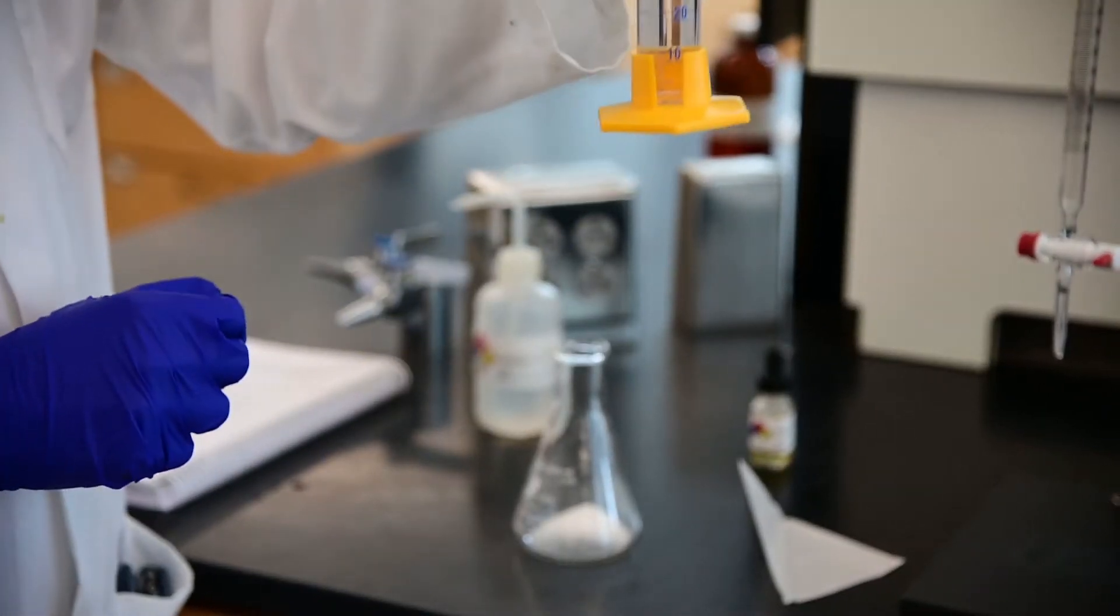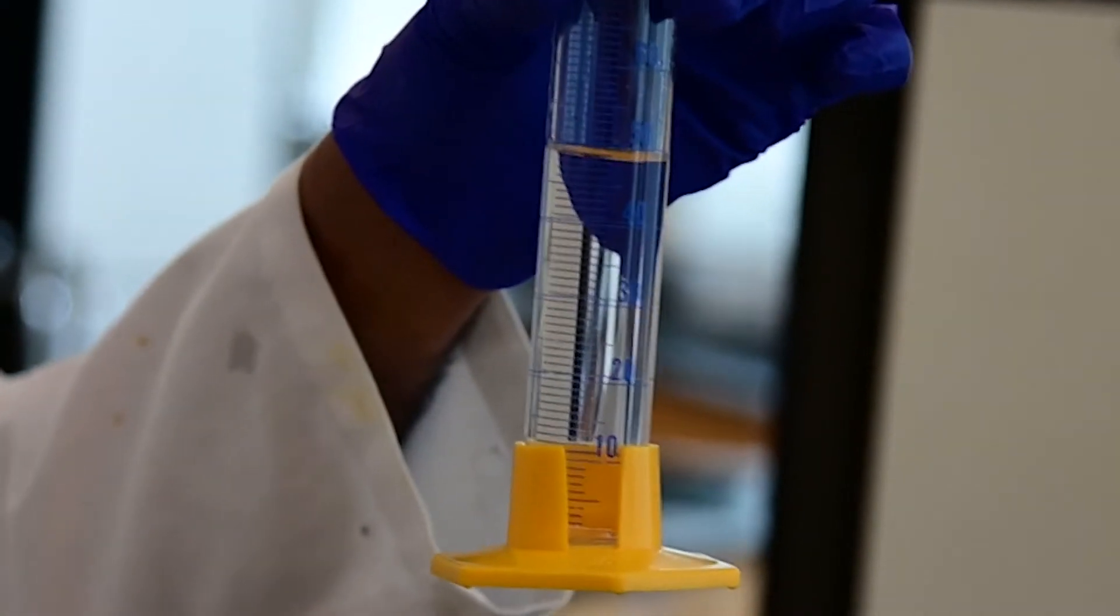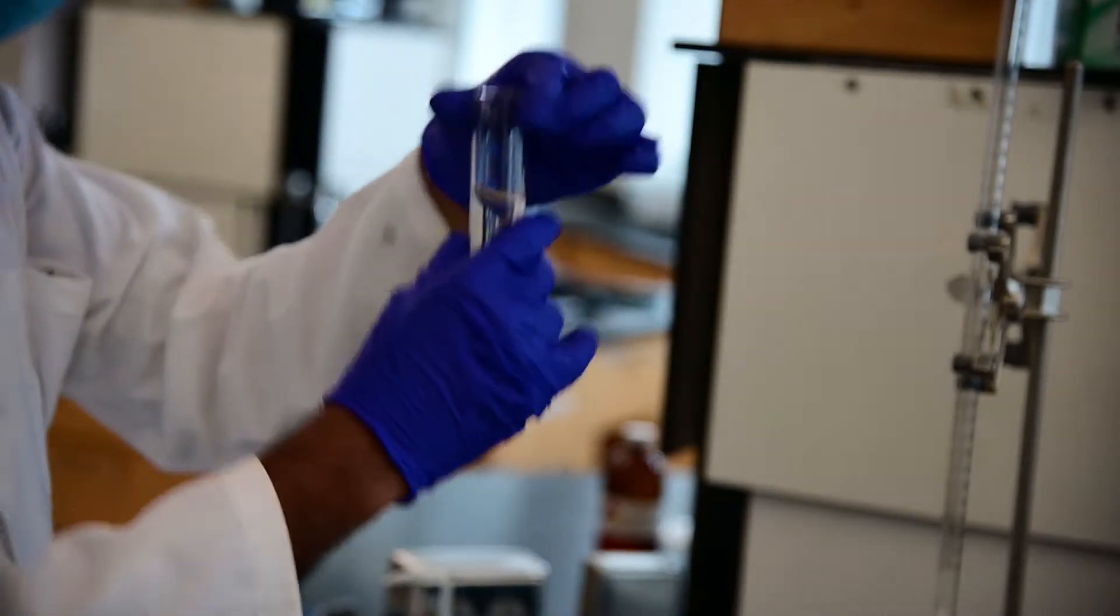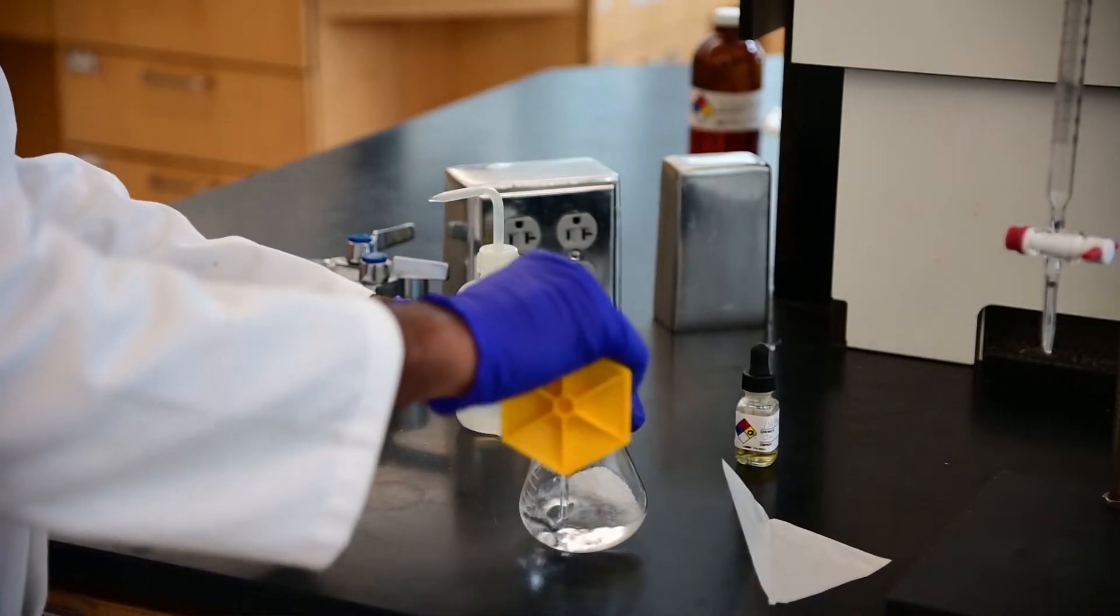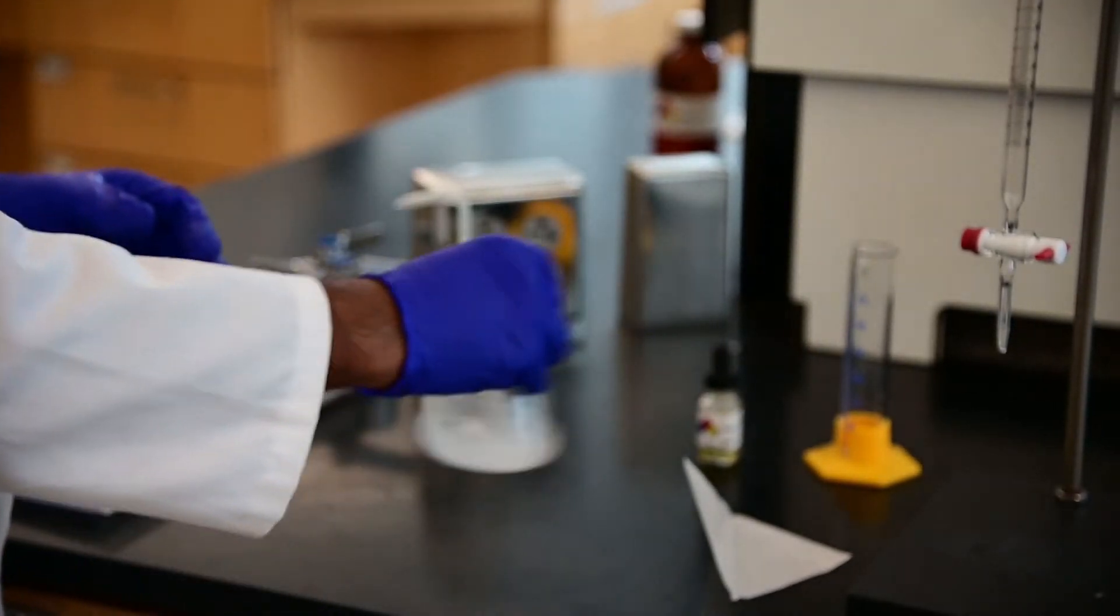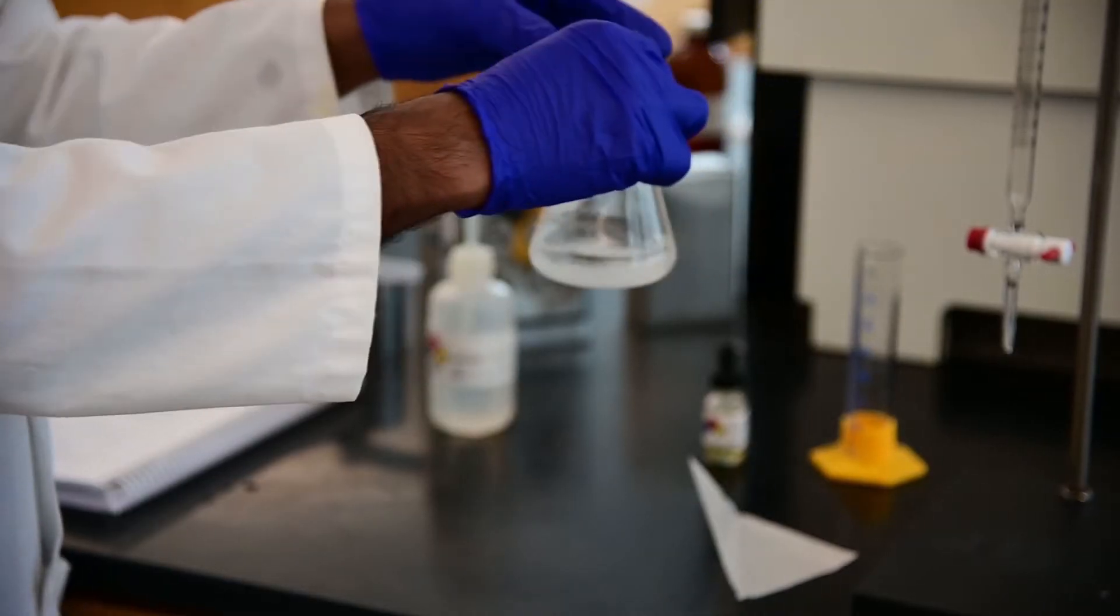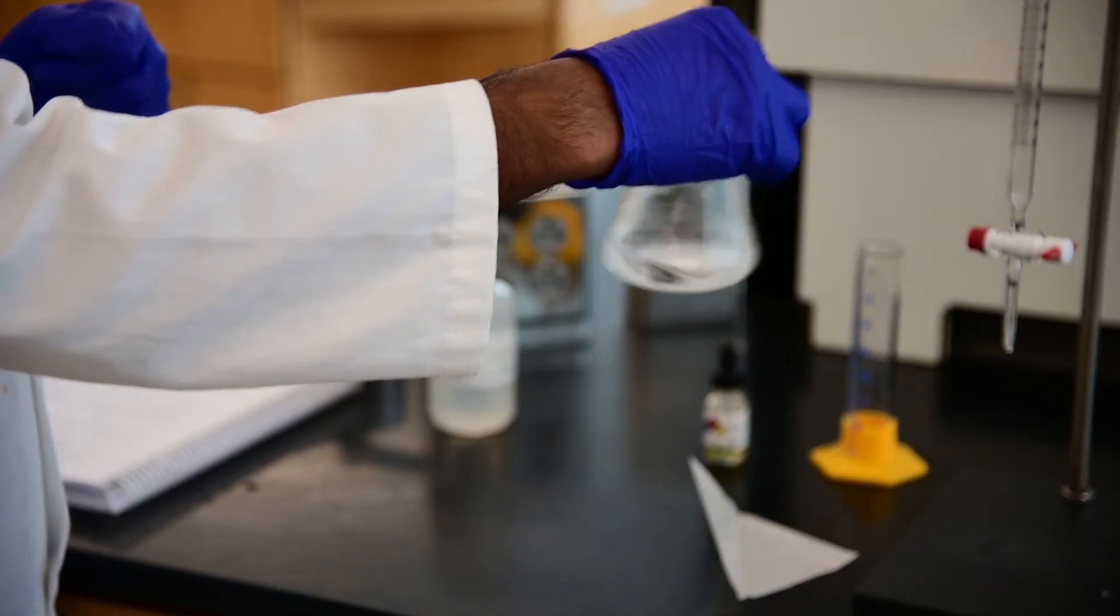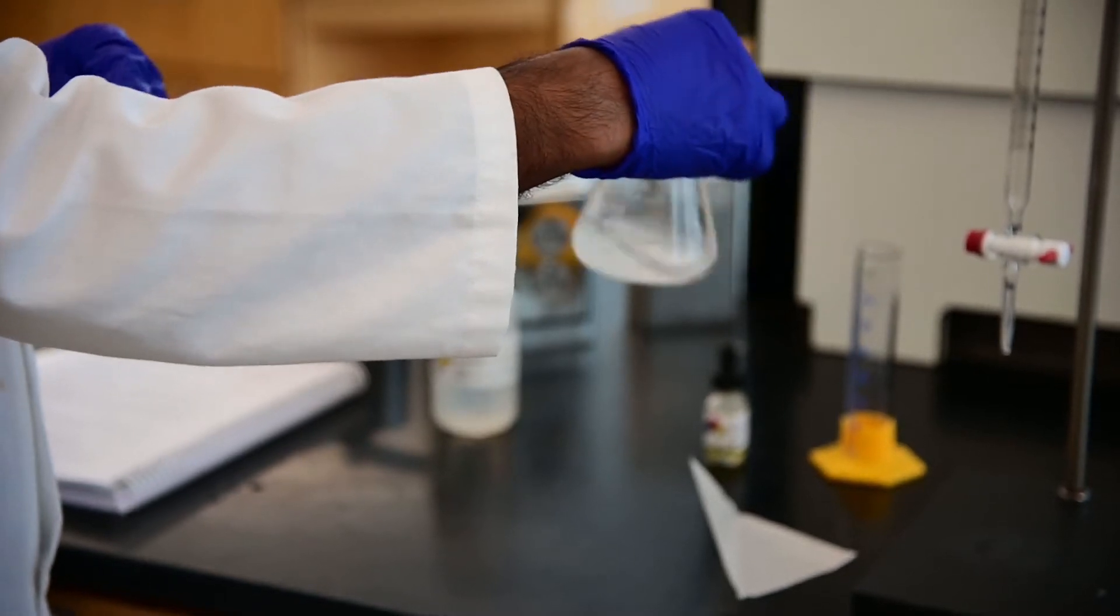Now I have 50 ml of distilled water in the graduated cylinder. I'm going to transfer that in the Erlenmeyer flask and make sure that the solid KHP is completely dissolved. It's important to make sure the solid is completely dissolved because that's the source of the acid in this reaction.